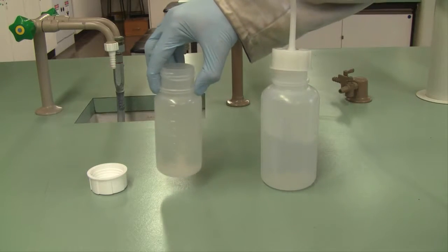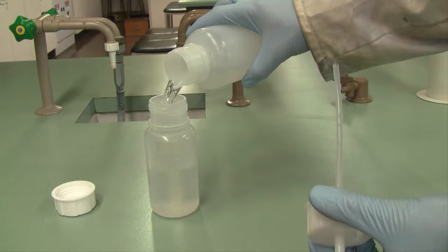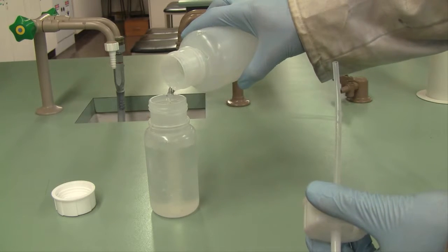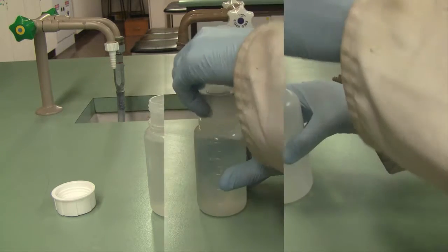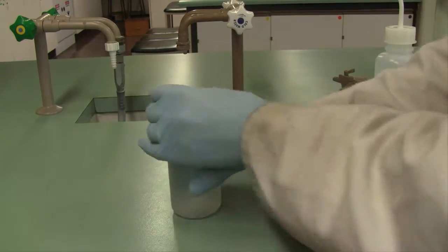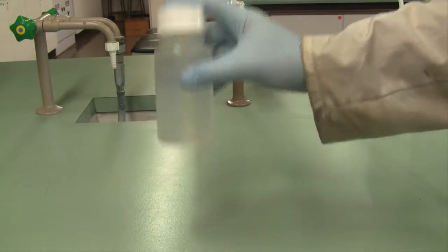Once they're dissolved, you can then add distilled water up to the 250 mil mark. Try to be as accurate as possible. Pop the screw cap back onto your reagent bottle and mix the solution thoroughly to ensure that you've got an evenly mixed 0.1 molar sodium hydroxide solution.